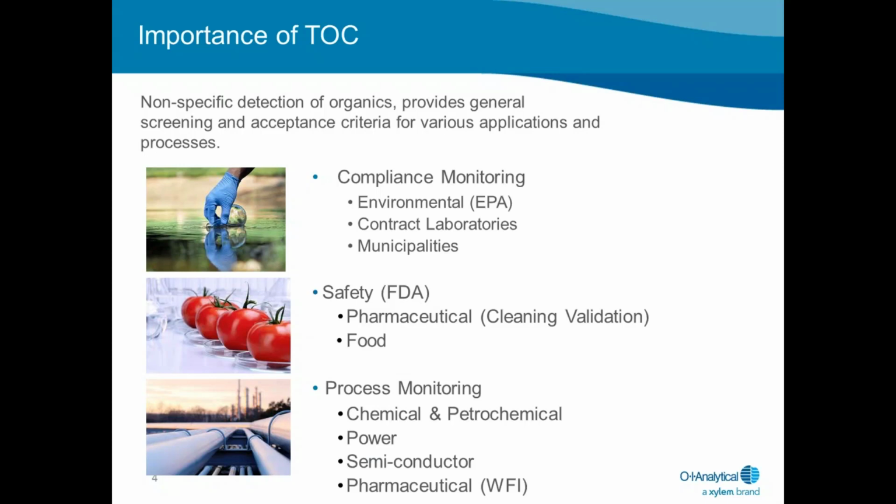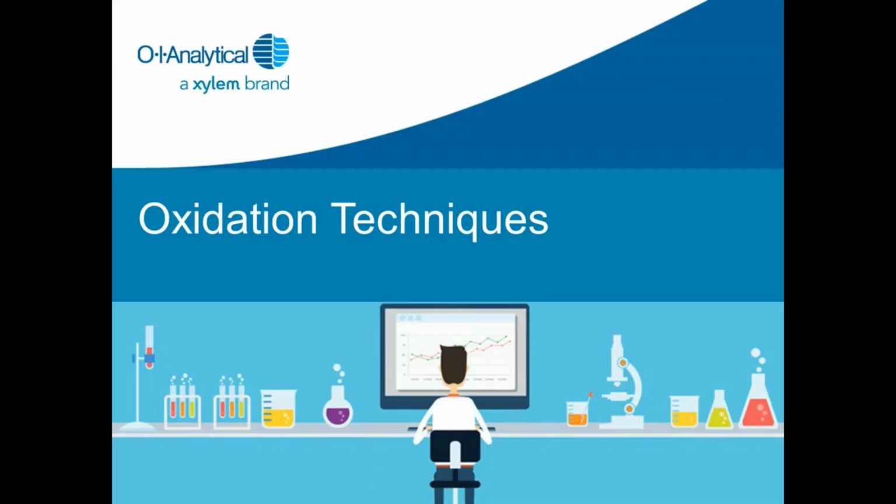For process control, a predetermined level of TOC has been defined, whether that be wastewater effluent from a chemical or petrochemical plant, or ultra-pure water for injection in the pharmaceutical industry. In those applications, TOC determination provides valuable insight into the proper function of the process.